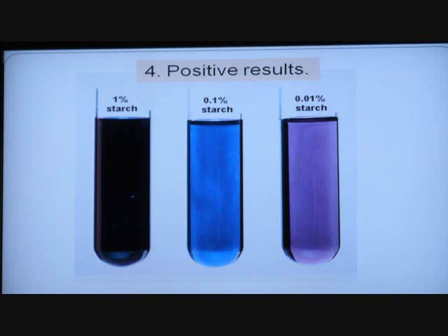Now, Benedict, you see that color in Benedict at all? That's the one where you see greens and you saw the orange and some reds. You'll see that color. Right? So that's pretty clear. Now, the middle one could be a negative for Benedict because it's blue, right? It's already blue. It ain't that blue though. It's not that blue. And Biuret's also blue, remember? Yeah. So those could be. And you can discuss that test tube for a while on all the possible options.